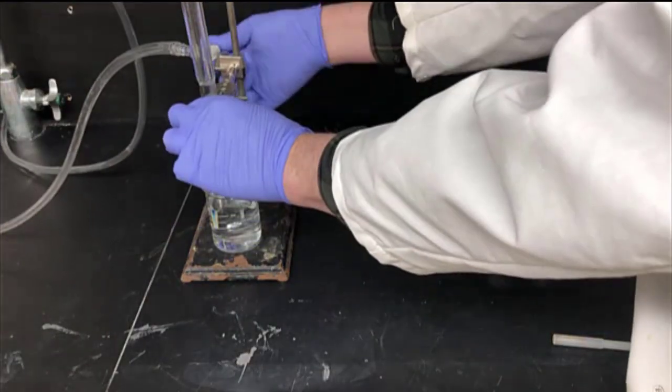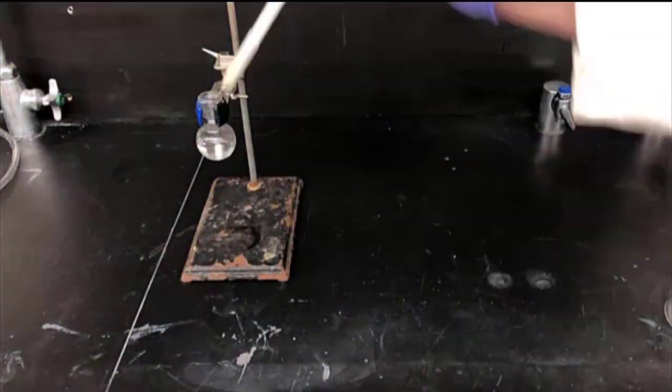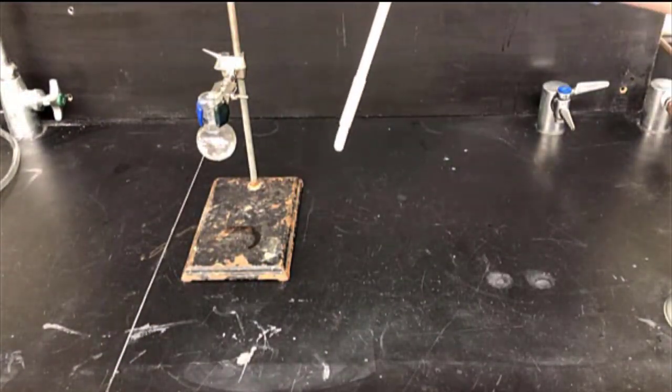When the reaction is cooled, you can remove the condenser and then retrieve the stir bar using this magnetic stir bar retriever. Essentially, this is just a magnet on a stick. This will allow you to pluck the stir bar out.